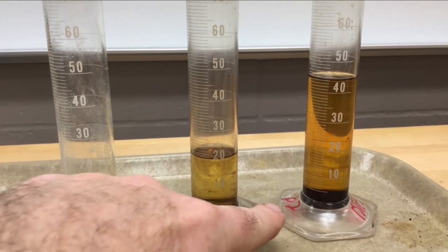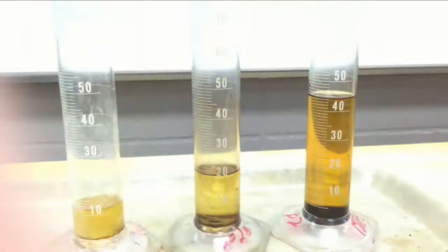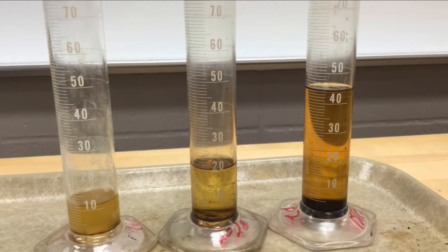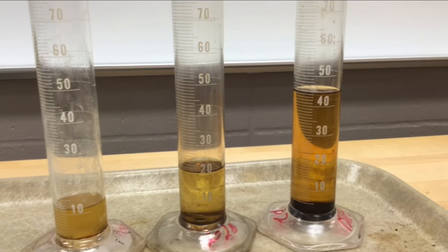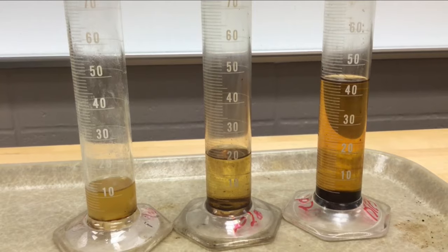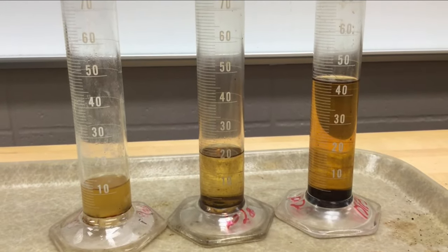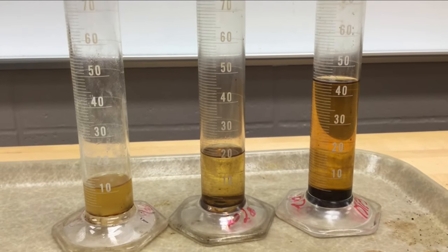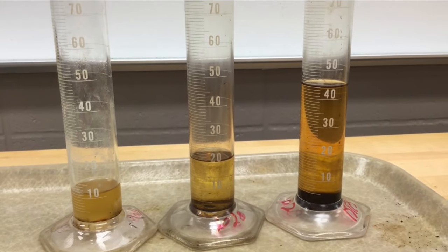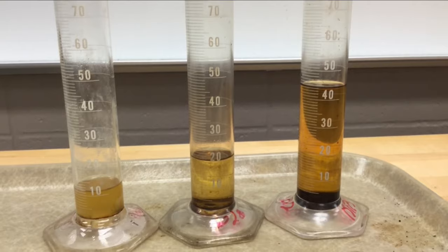And then it's like, well, why did I collect less diesel fuel over here on this one? Well, I may have had the temperature too hot and it went up too far. We maybe ran out of time. This is not a very precise measurement that I'm doing here. This is just giving examples to students as far as how distillation works and how we could separate the different fractions out of crude oil.